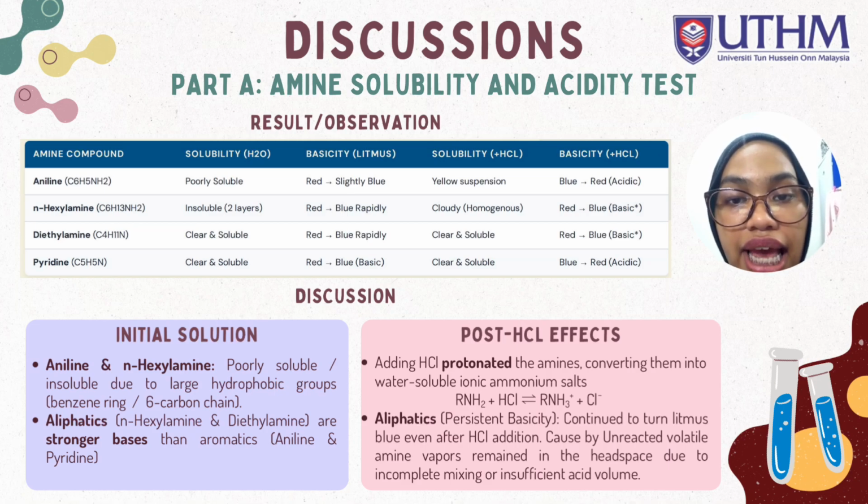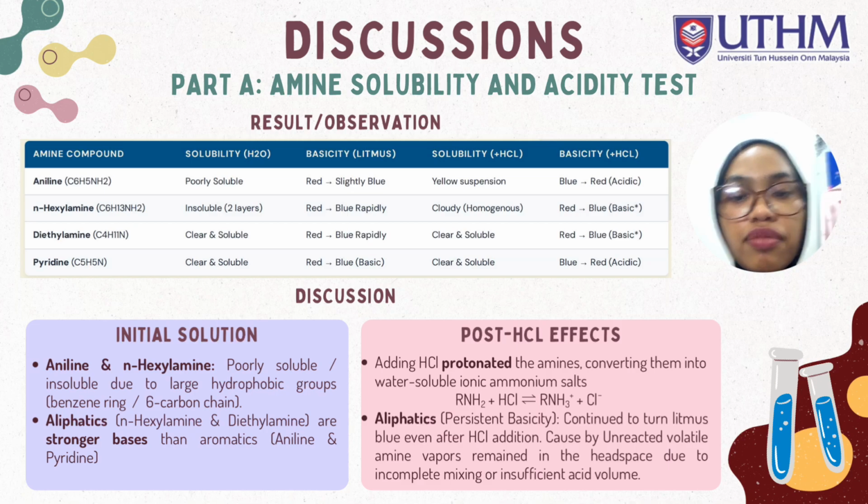Post-HCl effects: adding HCl protonated the amines, converting them into water-soluble ionic ammonium salt. For aliphatics, persistent basicity continues to turn litmus blue even after HCl addition, because unreacted volatile amine vapor remains in the headspace due to incomplete mixing or insufficient acid volume.